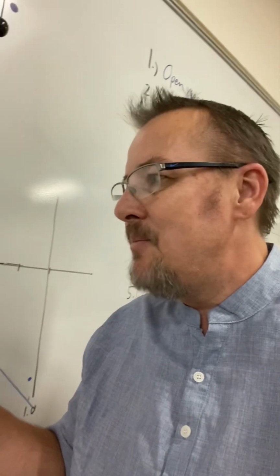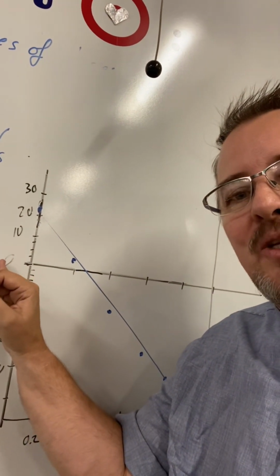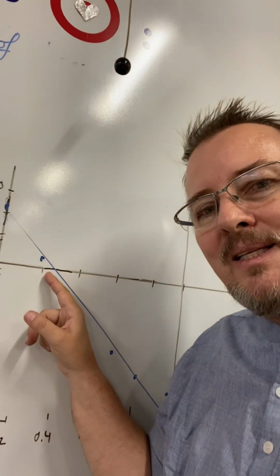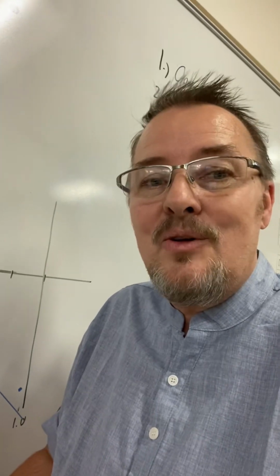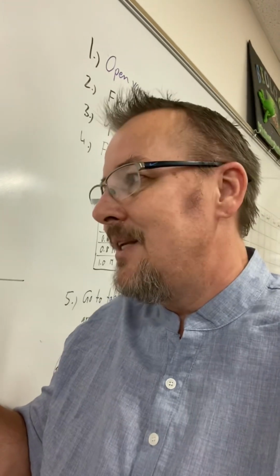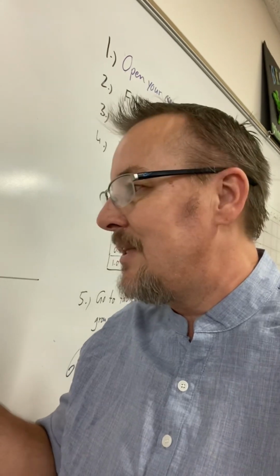If you said isotonic, that would be correct. And where's the cell isotonic to the surrounding solution? When there's no net movement, so that means there is neither a gain nor a loss of water, and there is 0% change. Where this blue line intersects with the x-axis, this is the place where it's isotonic, and we need to find out at what concentration this happened. Did we actually have a beaker with exactly that concentration? No, we did not have that. But because we have that graph and we have some data above and some data below it, we can now tell exactly what that number is.